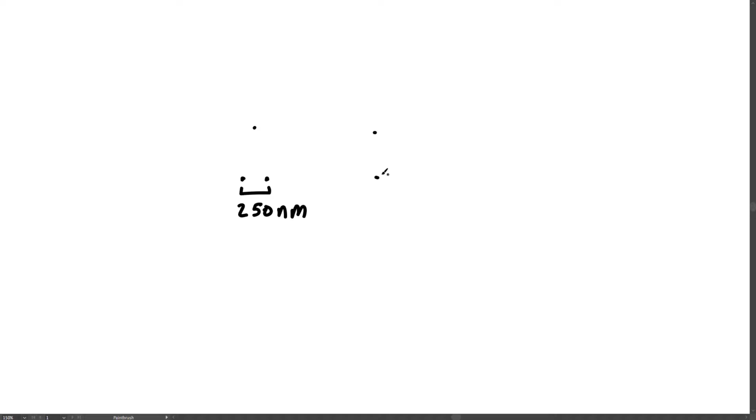So you can't differentiate between these two ideas, and you can't see the fact that these two dots are actually two. It appears as one. And it's worse in the z direction, that is anything closer than 750 nanometers will appear as a single object. So even though you can focus up and down, you can't figure out whether these two objects are independent, because they're just going to appear as a single dot like this.